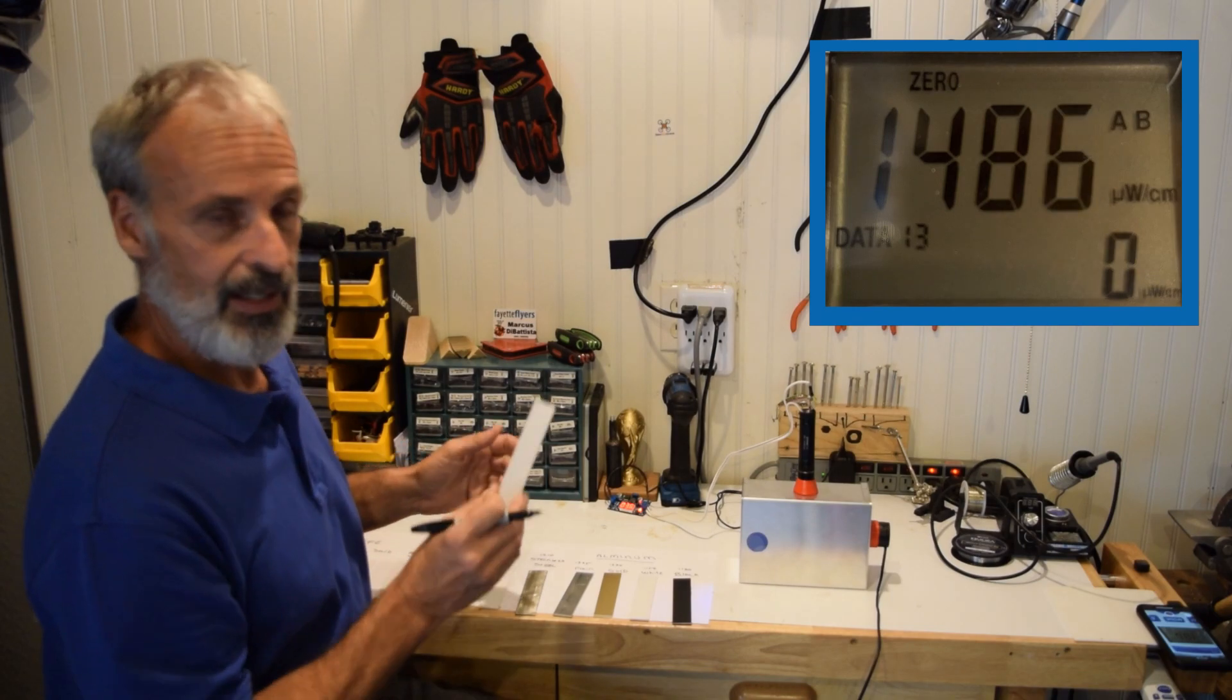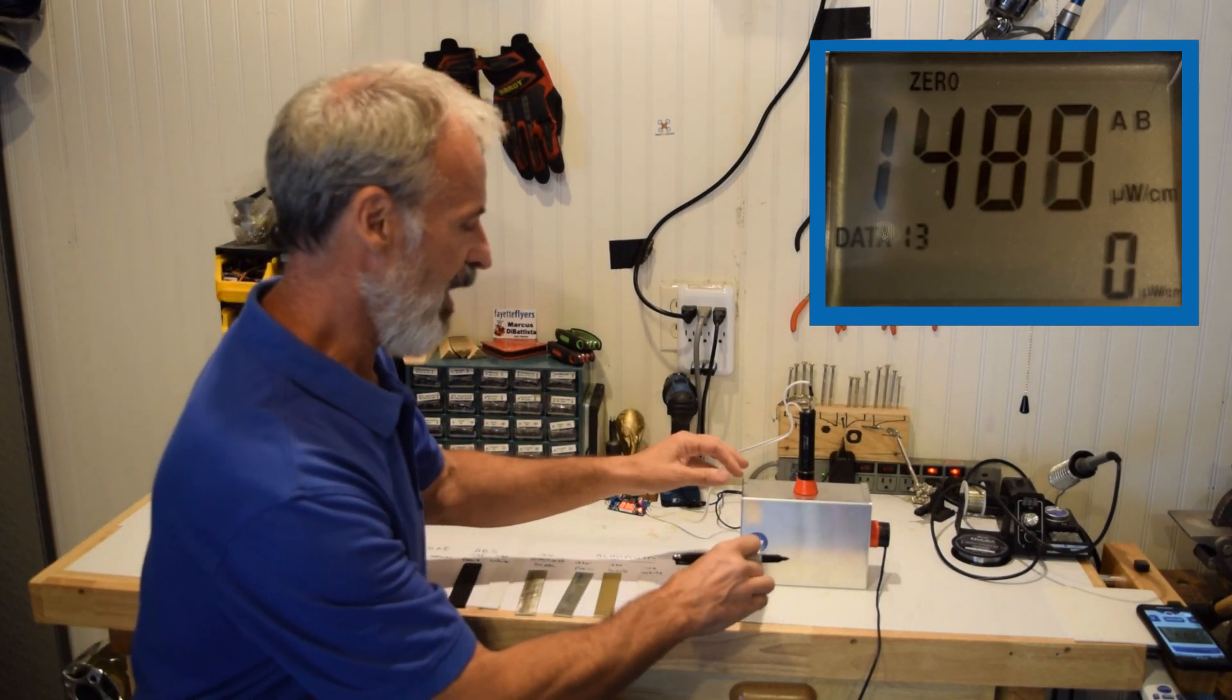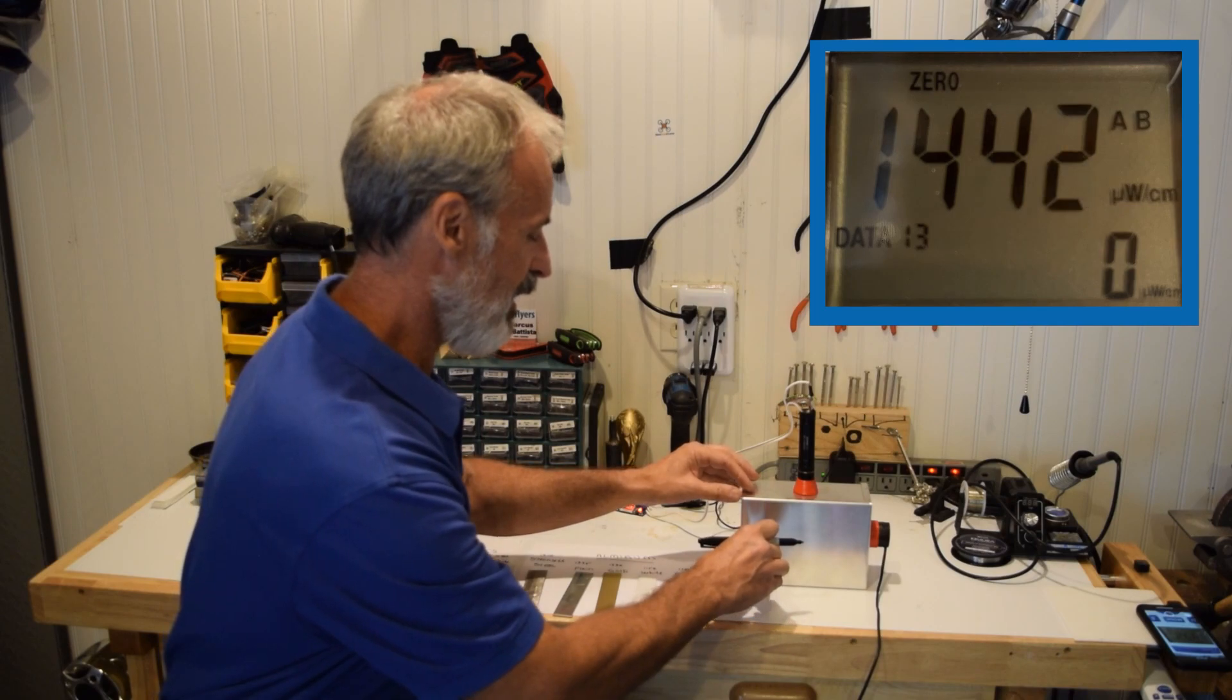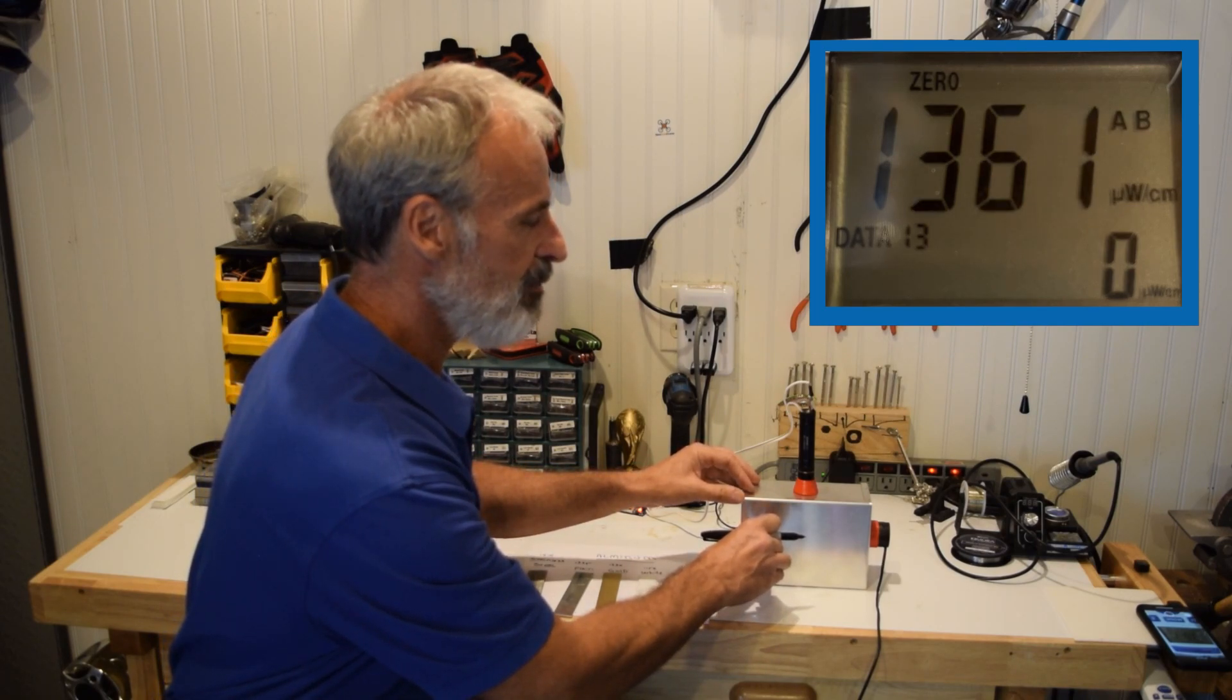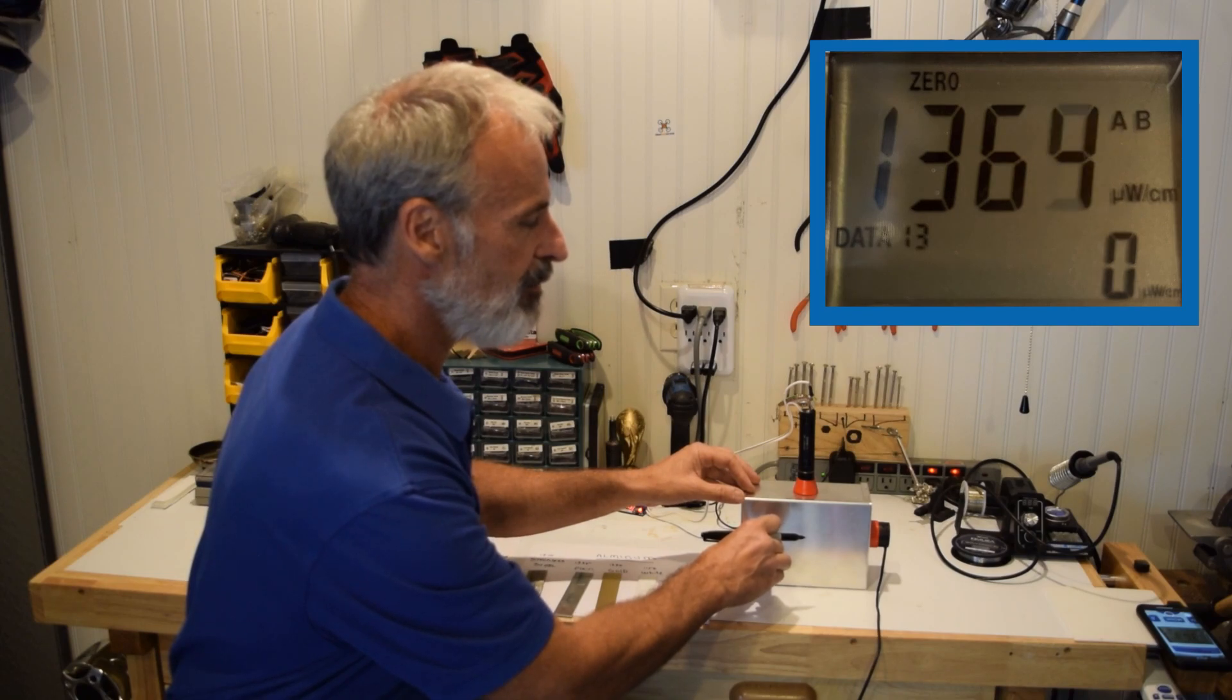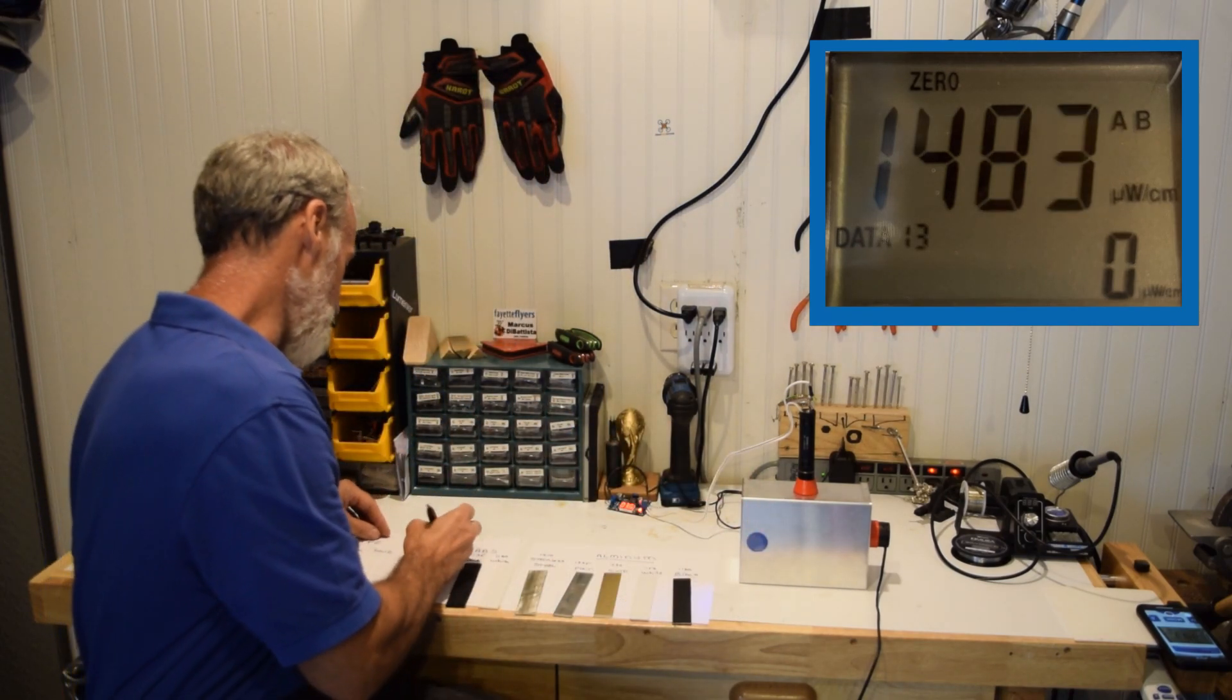Now we're going to high density polyethylene. This will show what happens when you've got something that actually transmits some light and reflects some. So you can see HDPE 1,360. Not too bad.